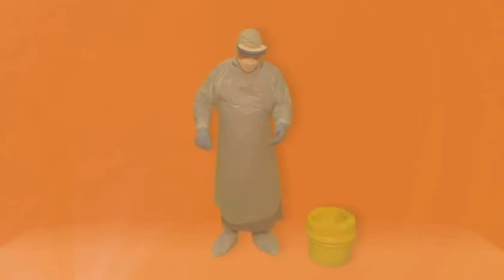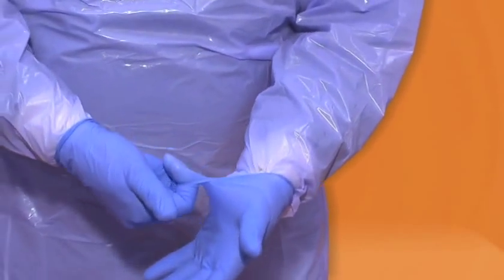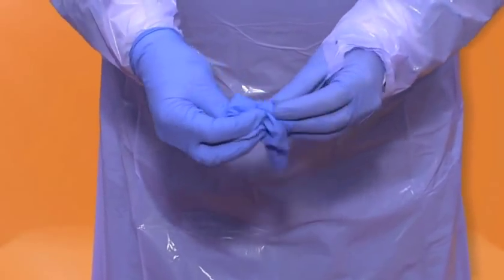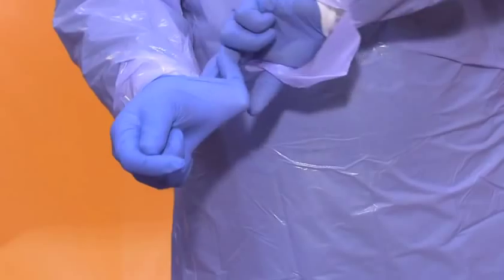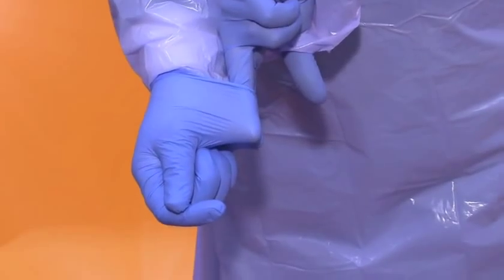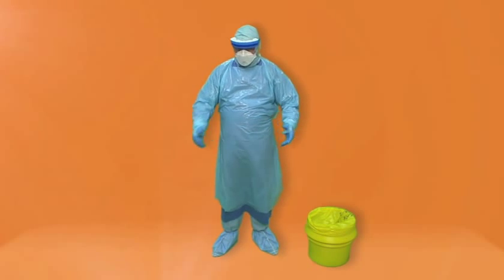Outer gloves. Remove the outer gloves first. The outside of the glove will be contaminated. Grasp the outside of the glove dirty to dirty with the opposite gloved hand. Hold the removed glove in the gloved hand. Slide the finger of your clean gloved hand into the inside of the glove, clean to clean. Peel the gloves off so that they are turned inside out and dispose of as clinical waste in a yellow bag.